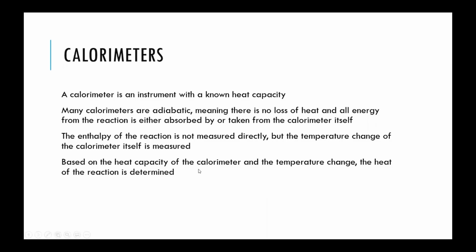So a calorimeter is something that has a very well-known heat capacity, and many of them are adiabatic, meaning there is no loss and no gain of heat, and all of the energy is contained in the calorimeter.